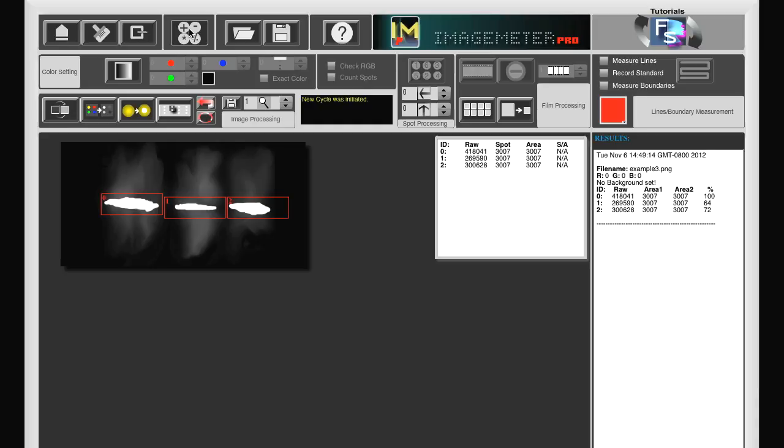We get the absolute density values and the values relative to the first band. This gives us a rough estimate.